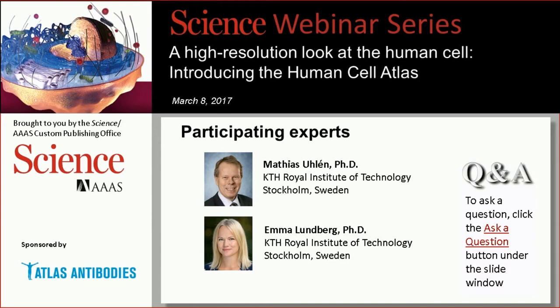Great. The next question, possibly Dr. Lundberg, this one would be for you. The viewer asks how protein expression is quantified and follows up with asking, can low levels of protein expression be reliably detected and reported, for instance, transcription factors? So perhaps you could share what the low-end detection level is for the proteins in the cell atlas.